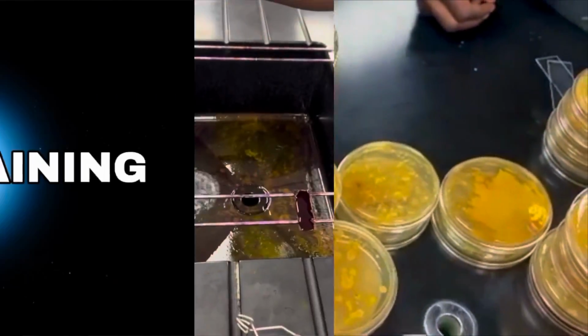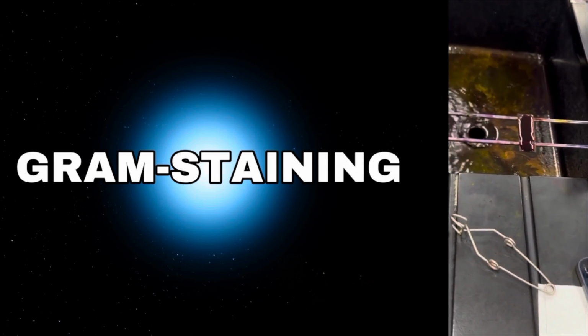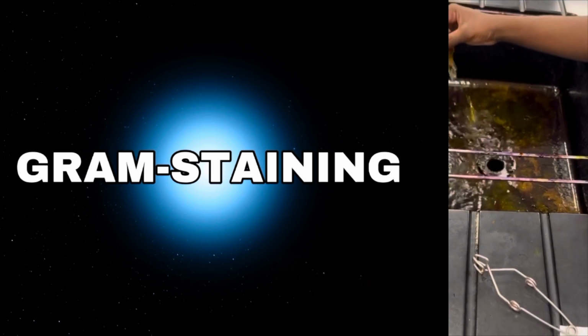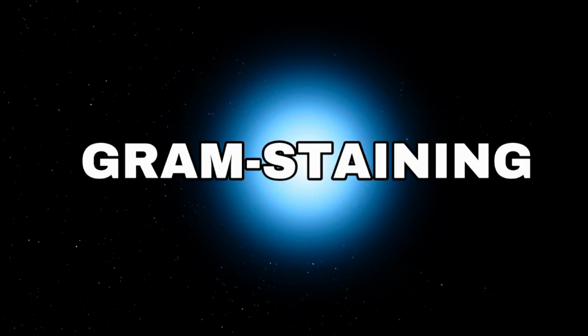Boy, are they dirty. Another technique practiced in the microbiology lab is gram staining. Gram staining is a method of staining used to classify bacterial species into two large groups, gram-positive or gram-negative. All right, let's get right into the experiment.